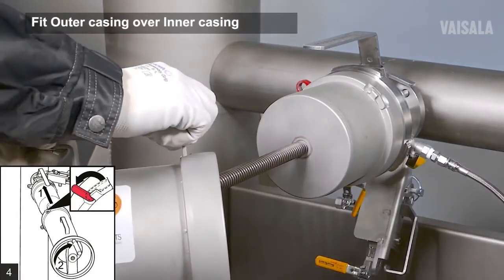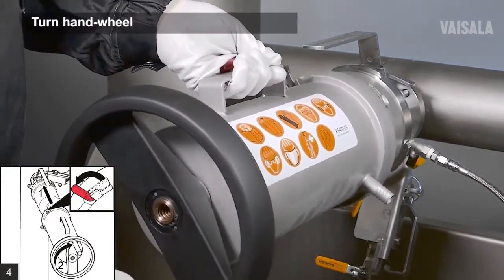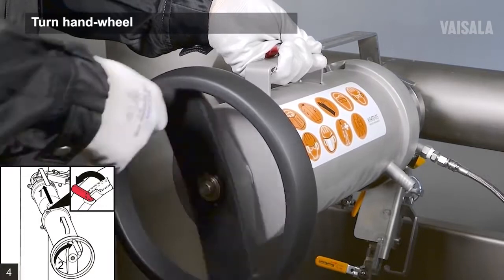Open the locking latch on the outer casing. Grab the outer casing with one hand on the handle and the other hand on the wheel. Fit the outer casing over the inner casing. Turn the hand wheel clockwise to get the thread of the inner casing running through the hand wheel.